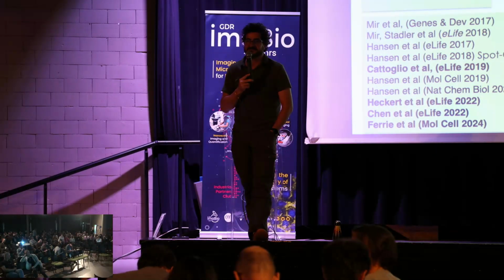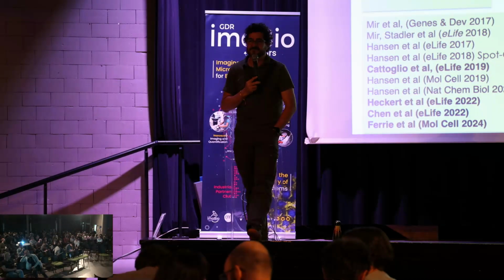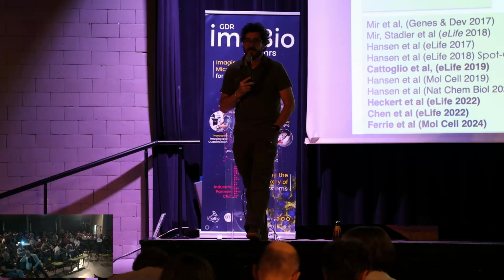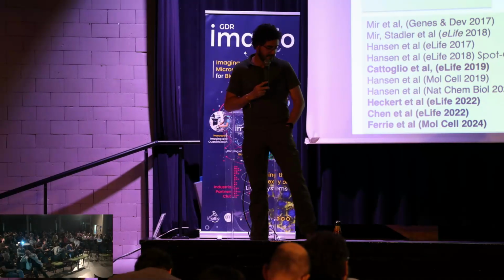Thanks for the talk. I have a pretty naive question, or maybe I missed it, regarding the PAPA. Is it a FRET thing between the receiver and the sender?